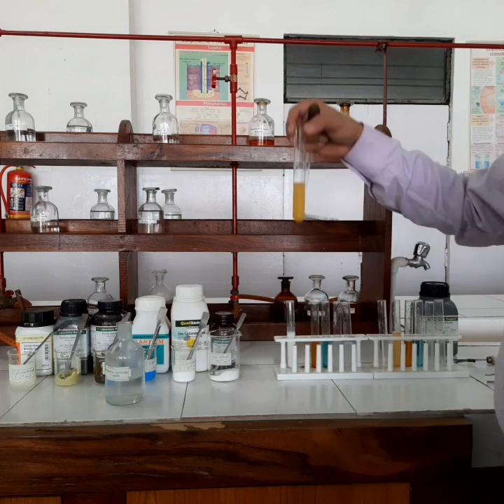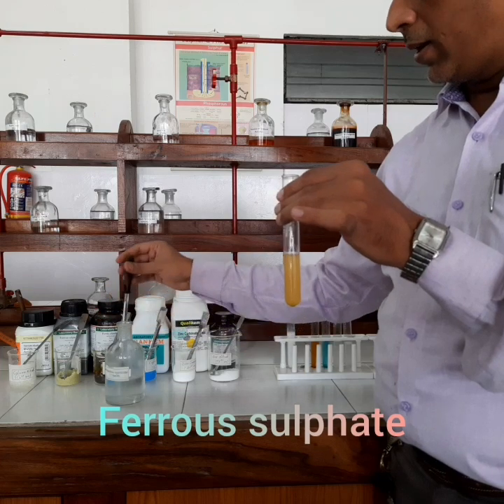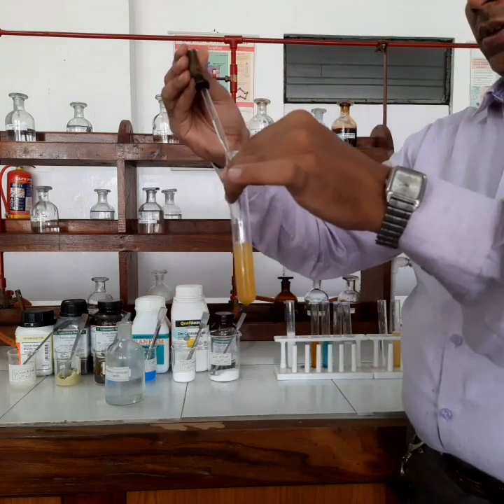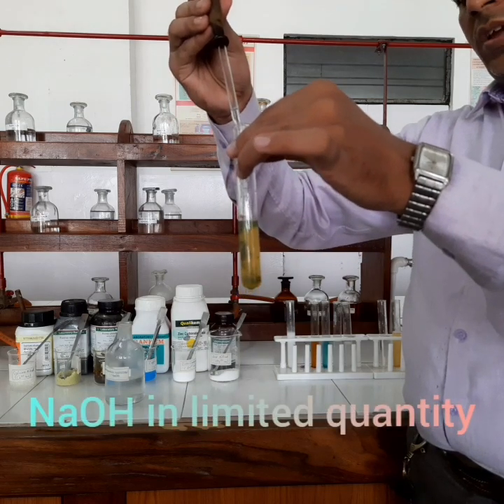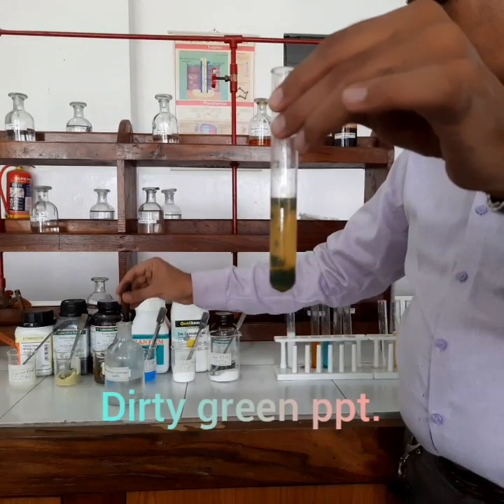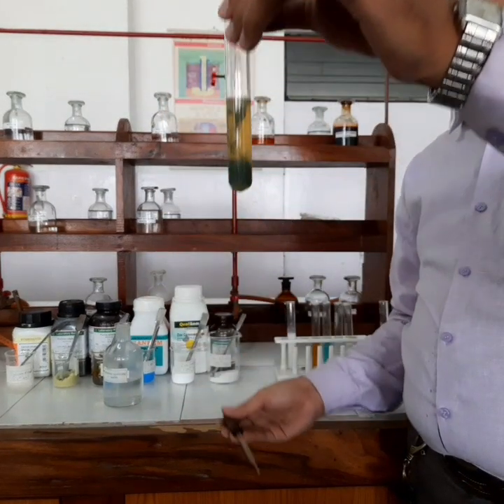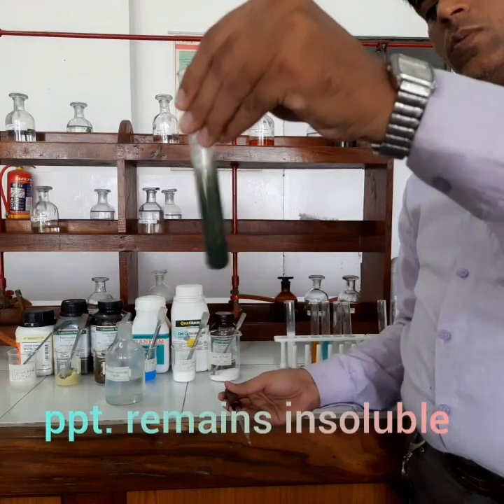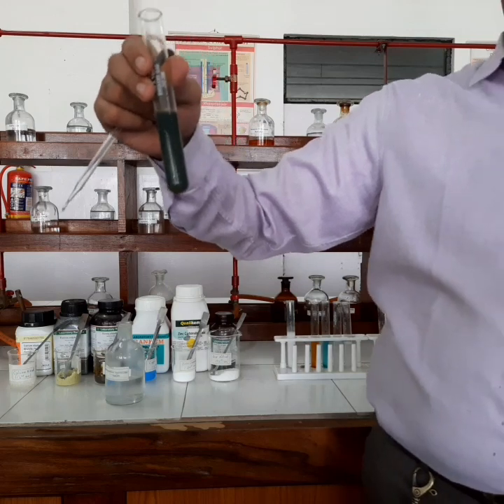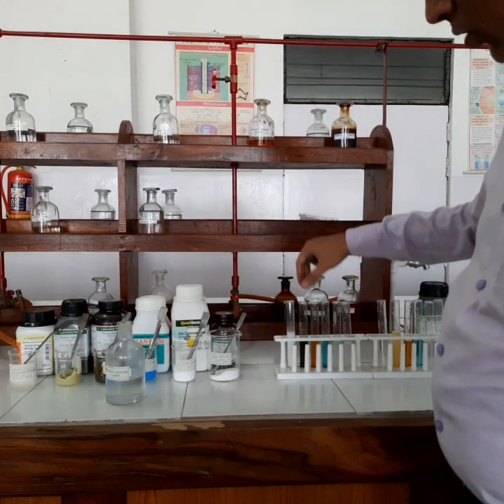Now I am taking the aqueous solution of ferrous. For that I have taken the aqueous solution of ferrous sulfate, and I am going to add NaOH first in limited quantity and then in excess. On adding NaOH, as you can see, a dirty green precipitate is forming at the bottom of the test tube, and if I add NaOH in excess also, then the precipitate of ferrous hydroxide that has been formed will remain insoluble. On shaking the test tube, the precipitate can be seen, and it is still insoluble in excess of NaOH also. So this is for ferrous.